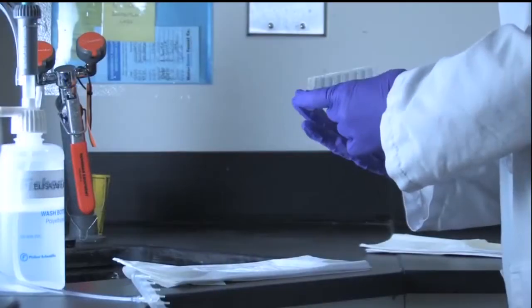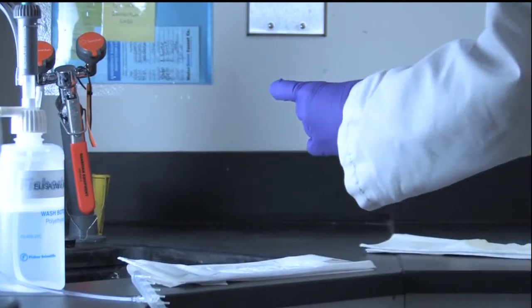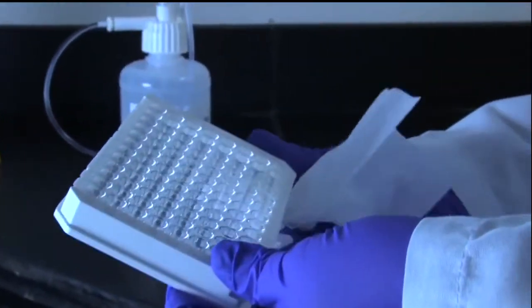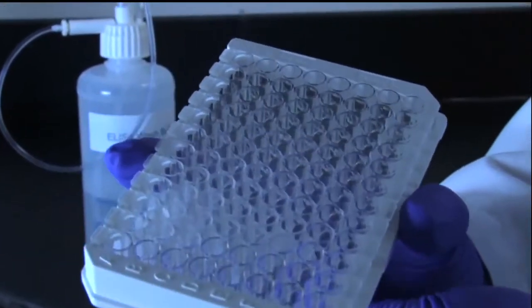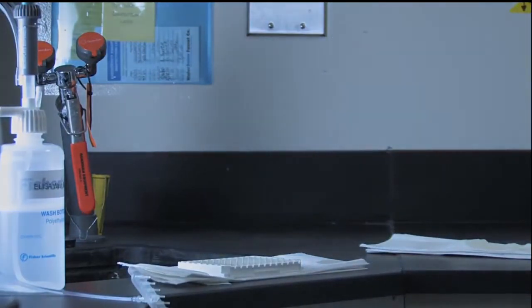Visually inspect the wells for excessive bubbles or residual wash buffer and repeat the tapping motion if necessary. Absorb any liquid from the plate frame, as well as from the bottom of the plate, before continuing with the next step of the assay. Proceed directly to the next assay step to prevent wells from drying out.